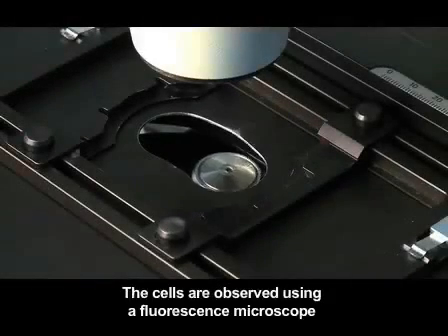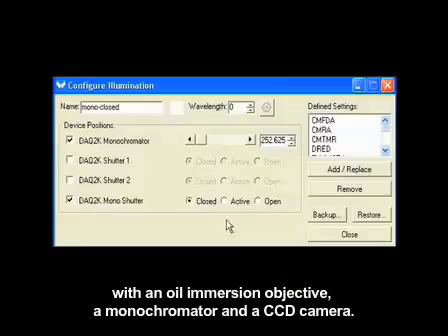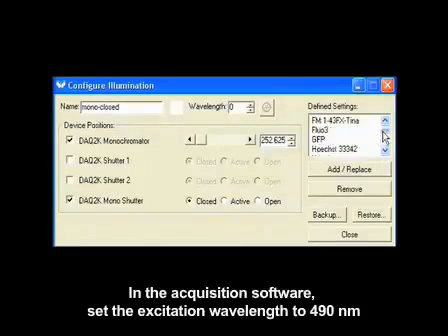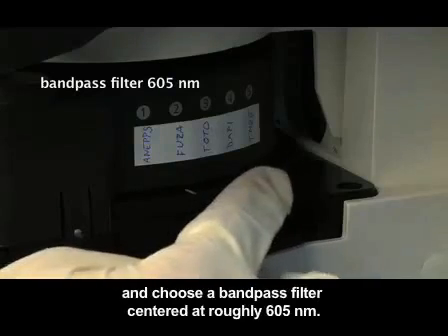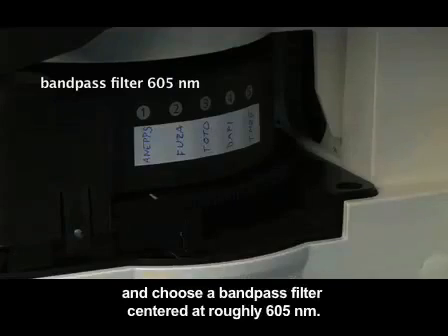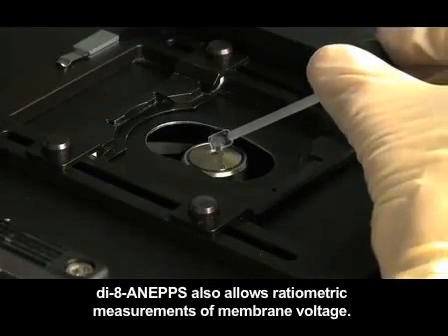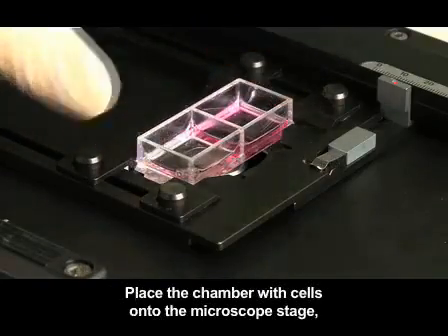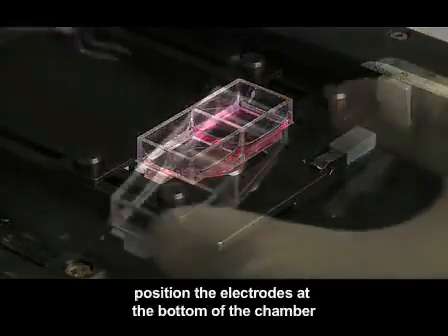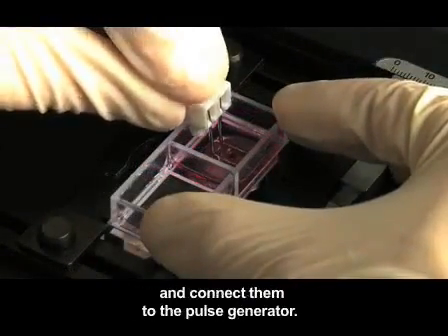The cells are observed using a fluorescence microscope with an oil immersion objective, a monochromator and a CCD camera. In the acquisition software, set the excitation wavelength to 490 nanometers and choose a bandpass filter centered at roughly 605 nanometers. Although not applied here, Di-8-ANEPPS also allows ratiometric measurements of membrane voltage. Place the chamber with cells onto the microscope stage, position the electrodes at the bottom of the chamber and connect them to the pulse generator.